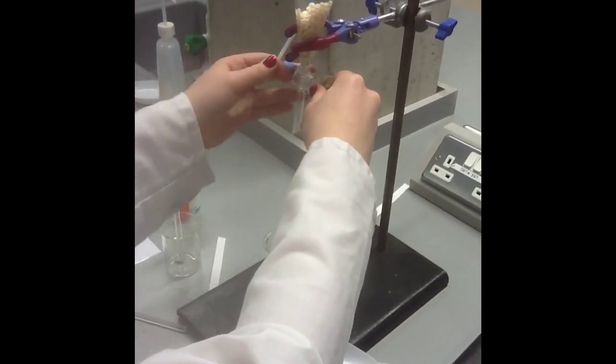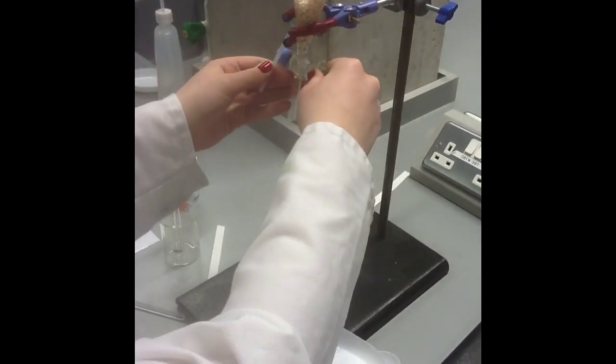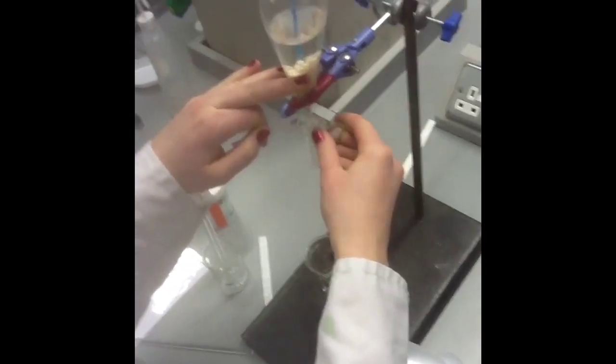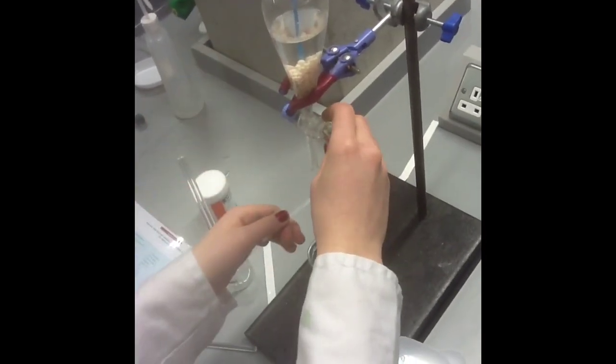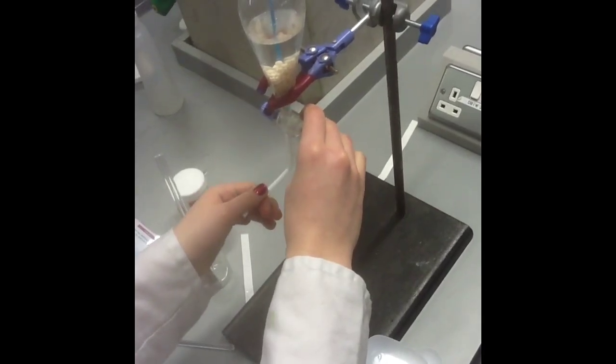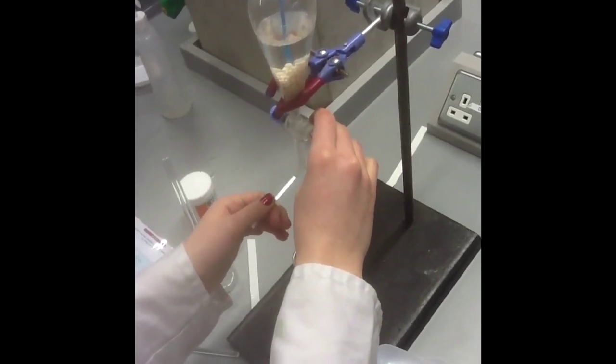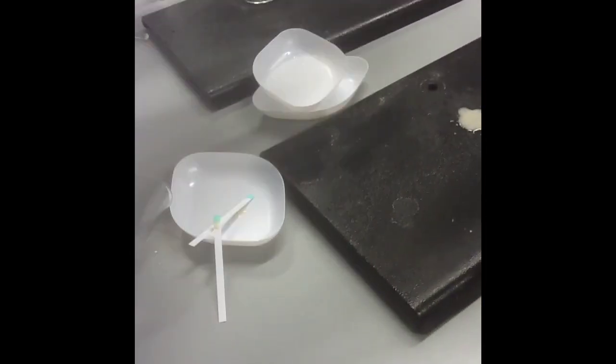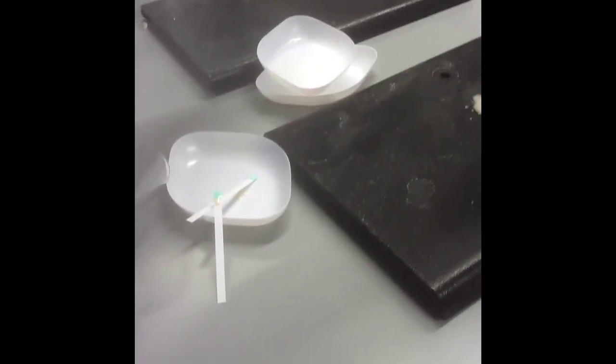Using glucose test strips, immediately test samples from each funnel for glucose. Repeat the test at 2 minute intervals until glucose appears in both. Make sure to record your results. It is important to place a beaker under each funnel to record the turbidity of the solutions from both funnels. This is basically how cloudy the solution is. Replicate the investigation or cross reference your results with other groups.